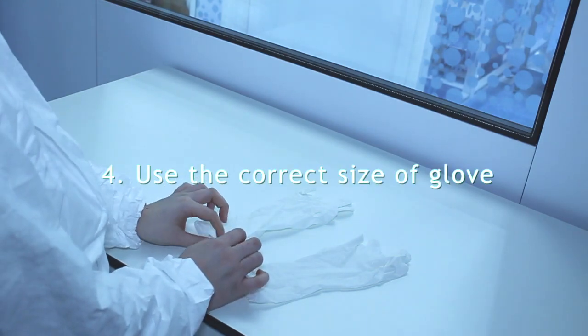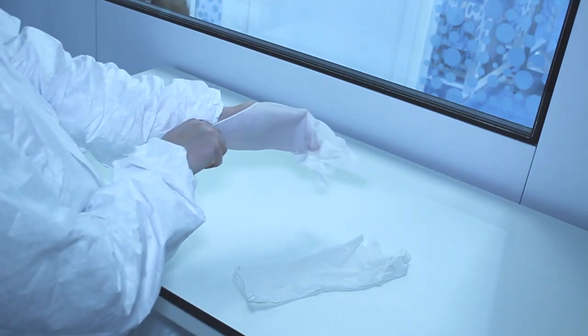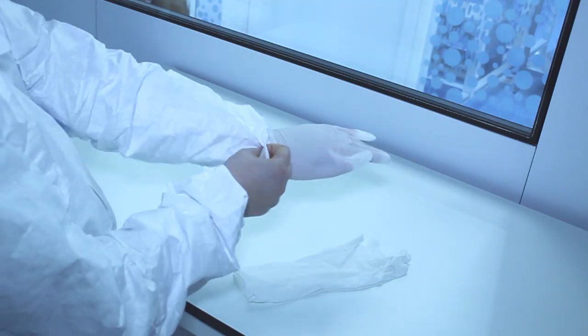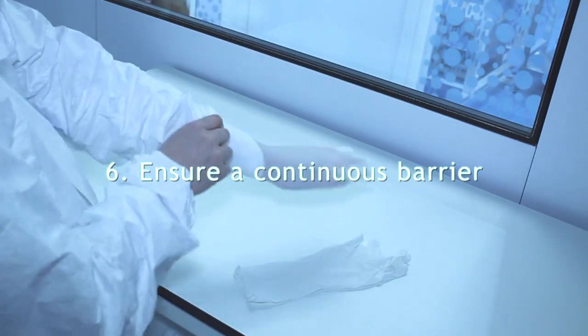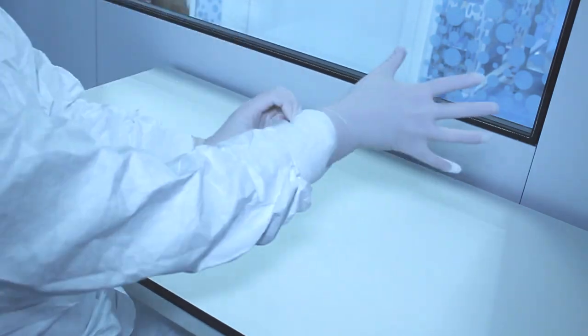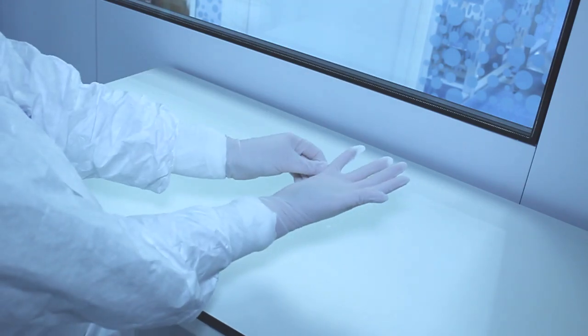Always ensure that you use the correct size of the glove. Put the glove on your most dominant hand first. The glove should cover the cuff of the garment to ensure a continuous barrier. Optional sleeve sizes are available to cater for varying arm lengths or protection.